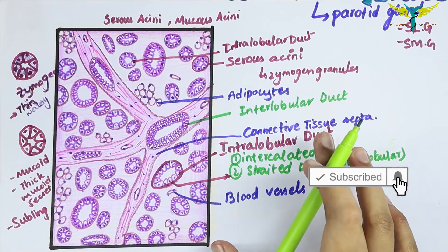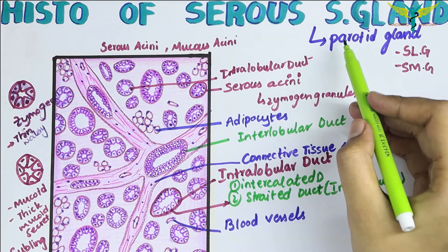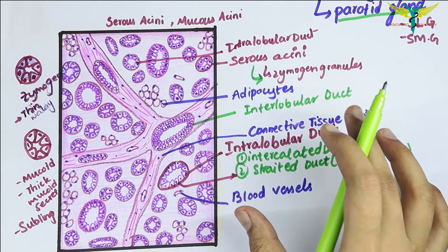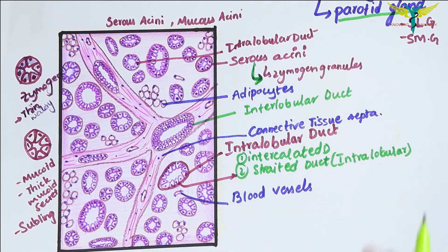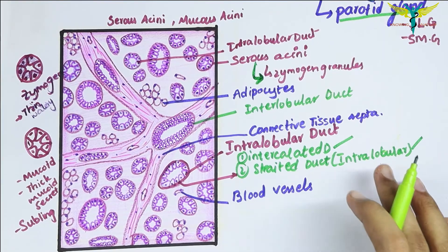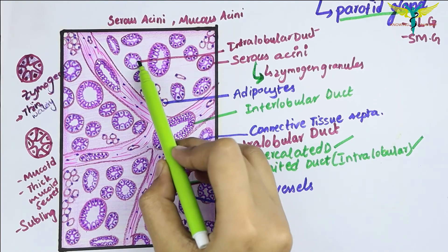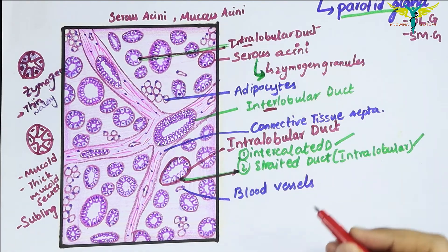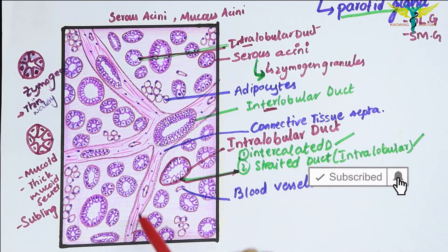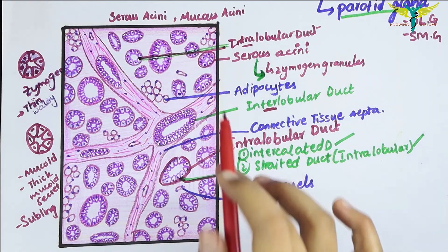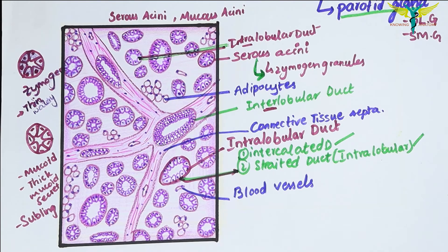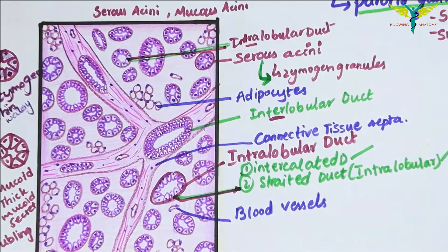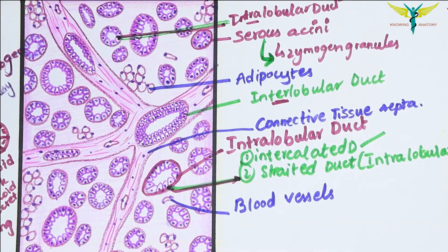To revise: the parotid gland is the serous type of salivary gland consisting mainly of serous acini stained dark due to basophilic zymogen granules. Intercalated and striated intralobular ducts are seen, as well as interlobular ducts. Do not confuse inter- and intralobular ducts — interlobular ducts are present in the connective tissue septa, while intralobular ducts are present within the lobules. Blood vessels, adipocytes, and connective tissue septa dividing the gland into lobules are also noted.